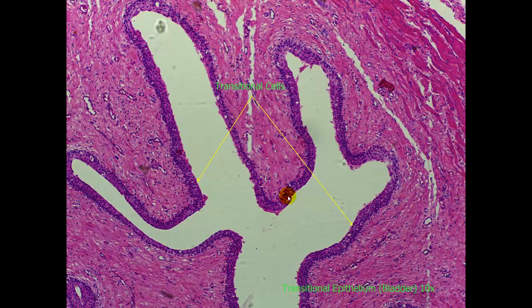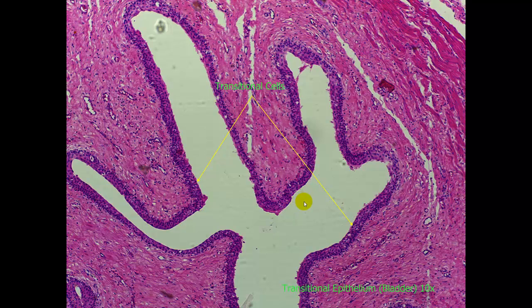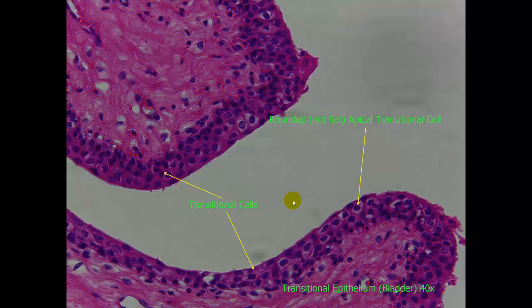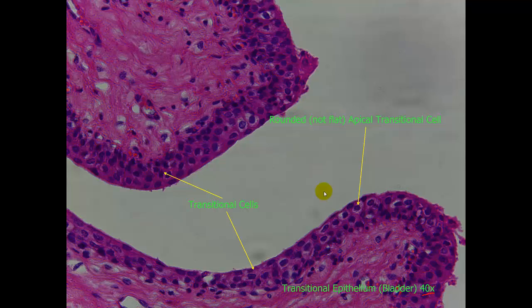Here is transitional epithelial. Transitional epithelial can be tricky. This is from the bladder at a 10x magnification. The reason it can be tricky is because it resembles stratified squamous, and sometimes it can be tough to tell apart. Here it is at a 40x objective, and one of the things that helps is that you will see these apical cells will be very rounded, as you see here.